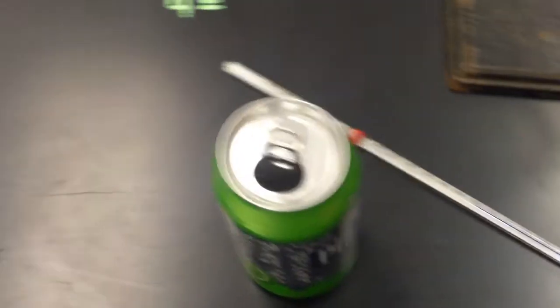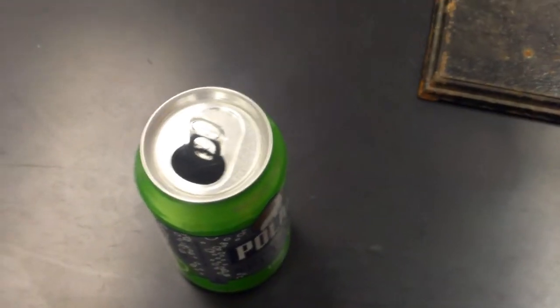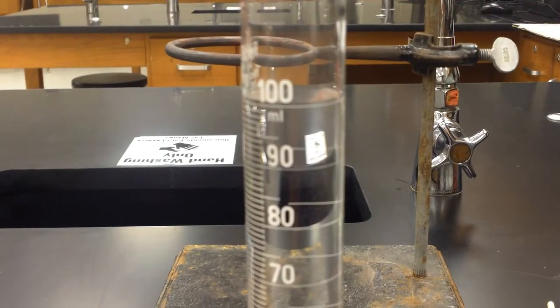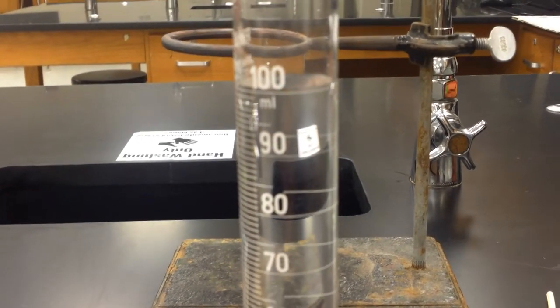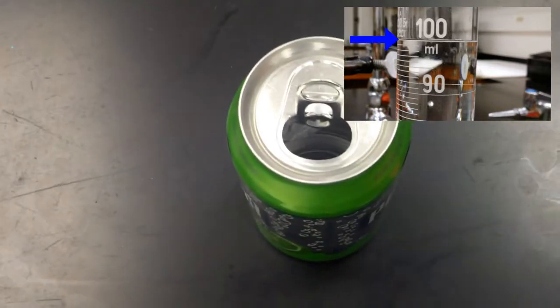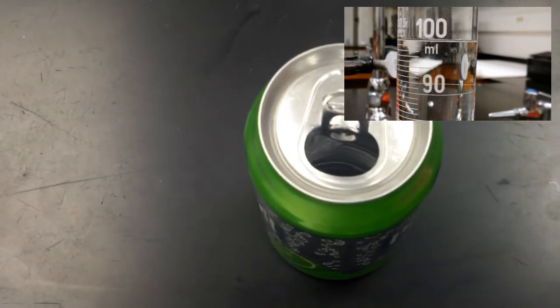The soda can is going to be used to hold the water that we're going to heat as we burn the candle. So in the graduated cylinder we have 100 milliliters of water. It's filled up to 100 milliliters and I'll take a picture of that as well. Now we're going to go ahead and pour the water from the graduated cylinder into the soda can.